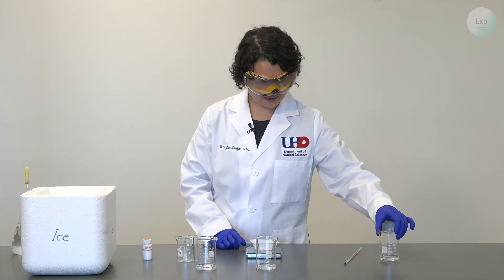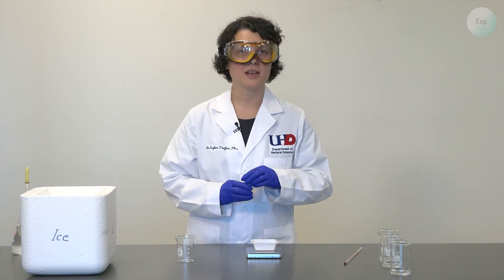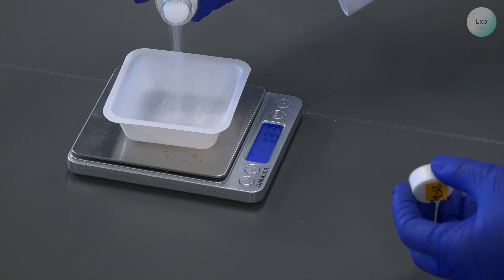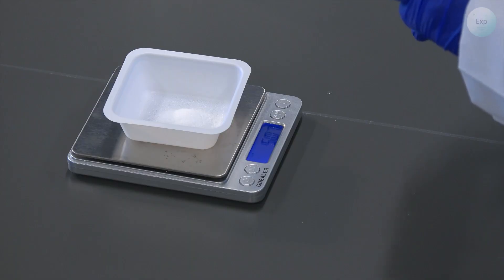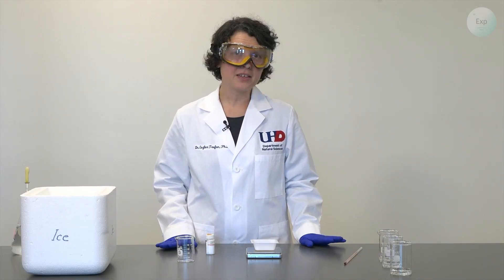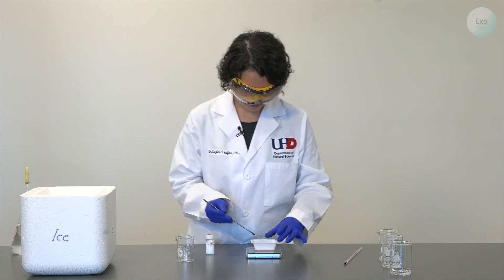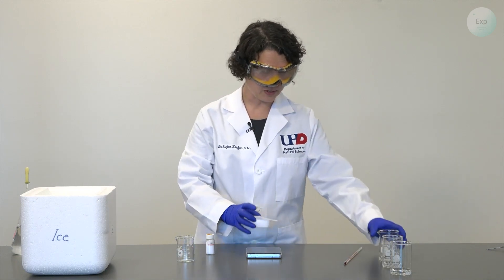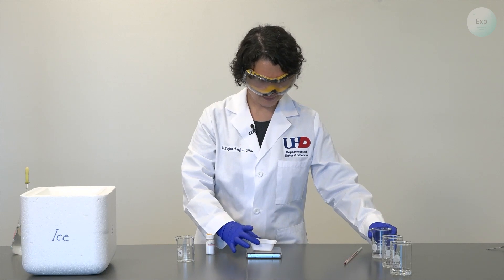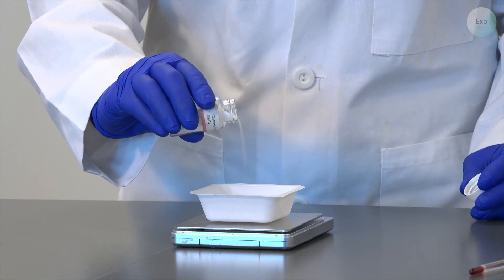Next, I'm going to place my weighing boat on the scale, tare it, and then first measure out 5 grams of sodium chloride. I have just a little bit more — it is 5.07 grams. At this point, I can make a decision whether to remove the excess or leave it and keep track of it. I will remove mine. And now I have exactly 5.00 grams of sodium chloride. I will add this to my first beaker. For my second beaker, I will measure out 7.5 grams of sodium chloride — it is 7.51 grams. I will add this to my second beaker.